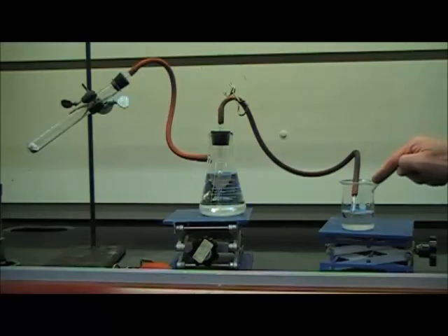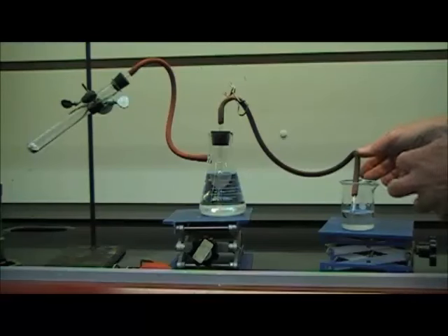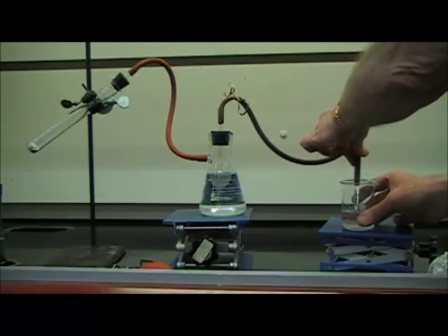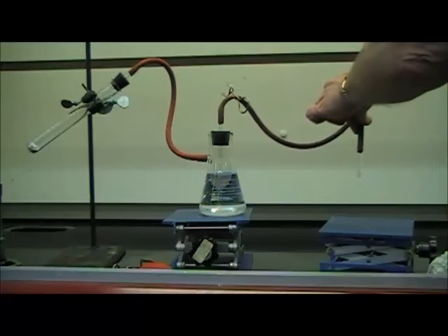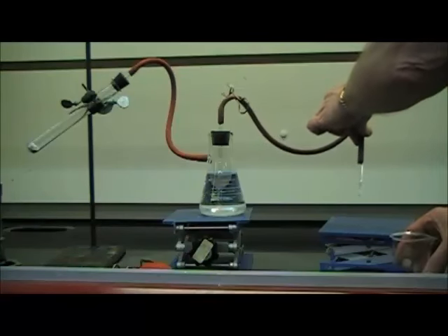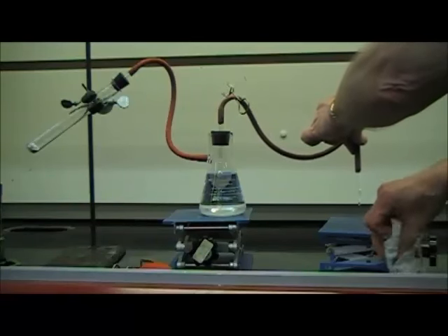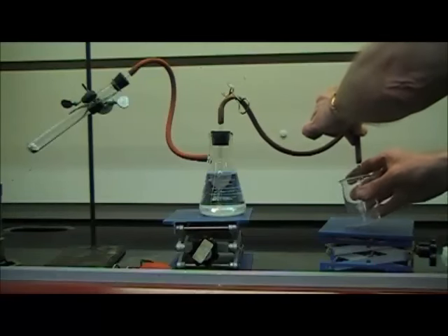I need to get the water out of here and into there without letting any air get up inside the tube. And normally this is done with two people and it's a little bit easier, but watch what I'm going to do here. I'm going to very carefully pull that out. Hopefully no air gets up inside. Just going to dump that. Just going to briefly dry the container. It doesn't have to be real dry.